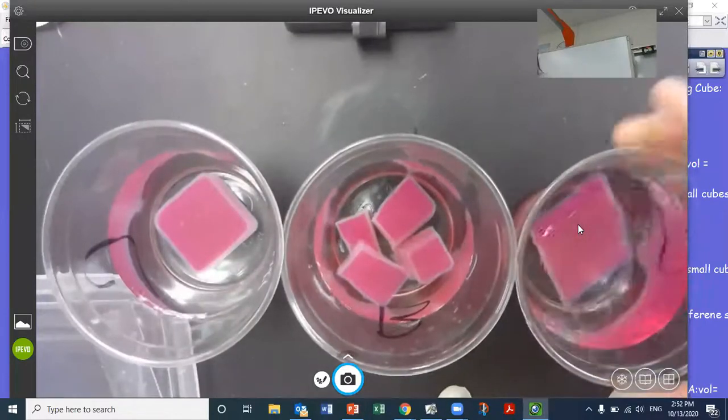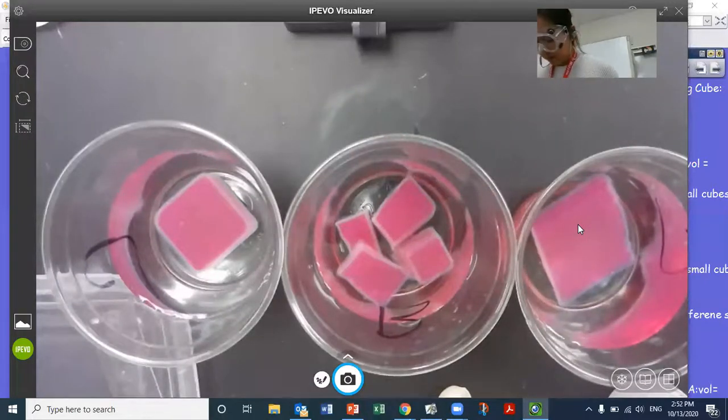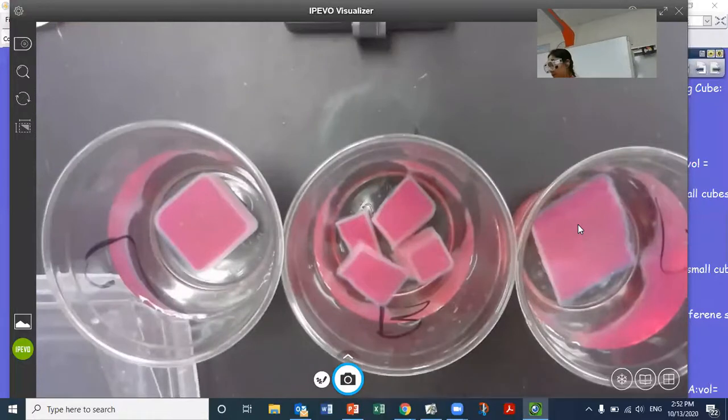That's not the thing that's affecting diffusion rate. And I want to start my timer. As you can see, it's starting to become really, really obvious that the white part on the outside is where the hydrochloric acid is neutralizing the NaOH. So we'll see in about, let's take our first time point around the 10-minute mark and see how it's going.